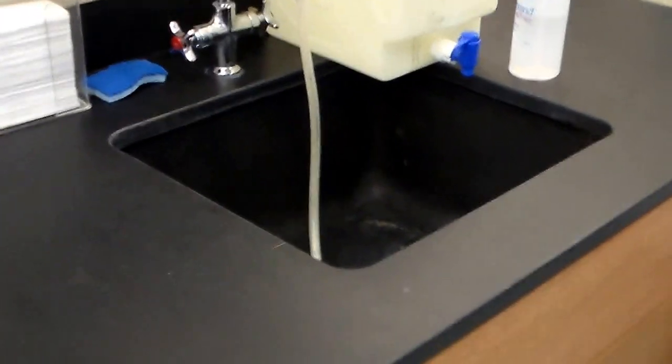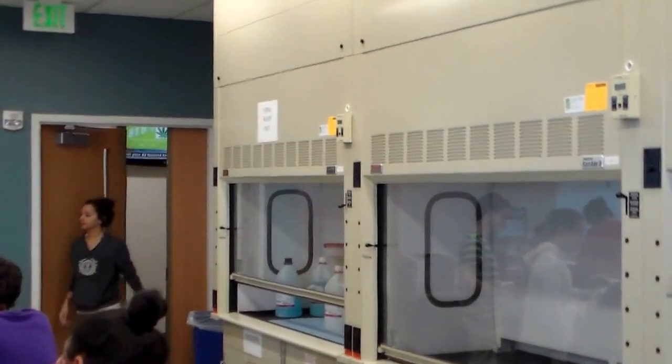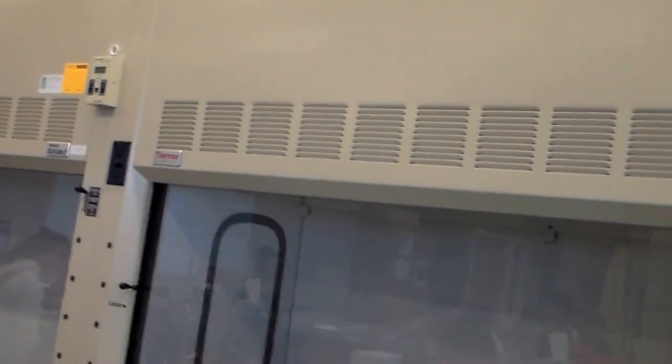We have sinks for disposal of only some limited things. Most things have to go into a proper chemical waste which is right there by the entry door. I'll go over there in just a moment. Nothing definitely safety relevant on the back wall that I'm seeing other than the clock. So let me come over to here.